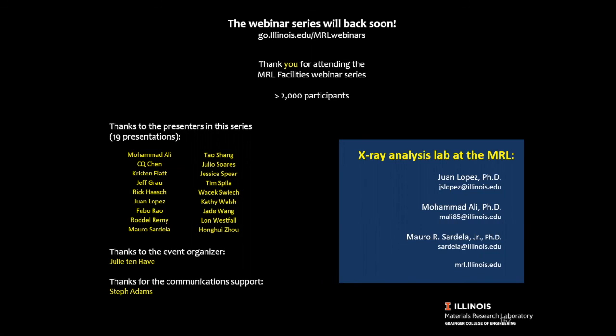I think the best way, if you have some Rietveld to do, is not to bother too much. Try to use some of the commercial holders with extremely low background. They will not interfere too much. That's the best way to do it. In terms of the hands-on software, we can show you how to do that if you're using Jade.